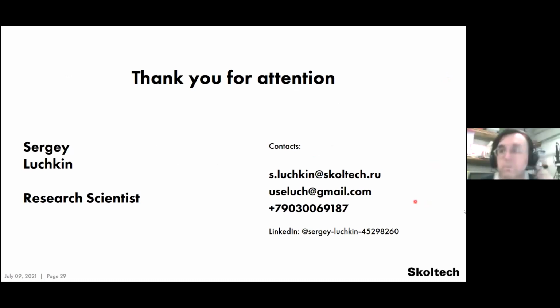Yes, I have a question. Yes, please, Igor. It's a very interesting activity and a very interesting application of the microscopy technique for investigating physical processes. I have a question about what microscopy is used and how you organize it. Maybe you say at the beginning you measure; at the same time you irradiate and measure the pattern, or do you separate this process?